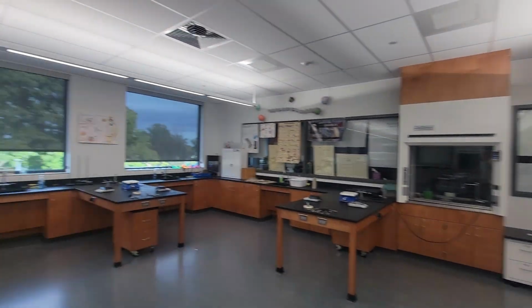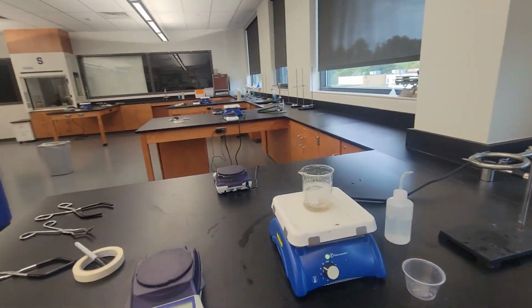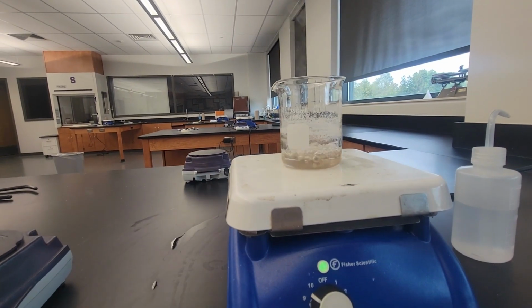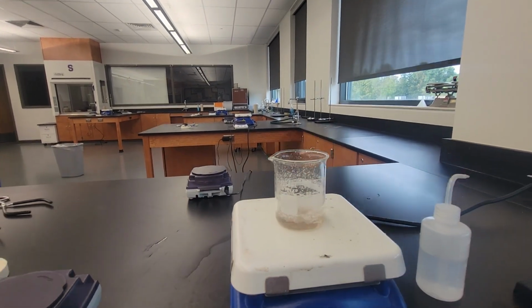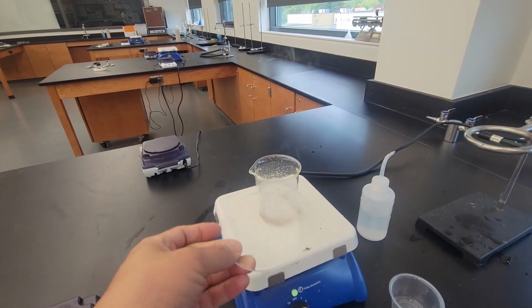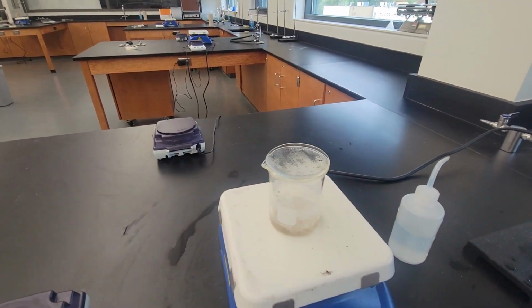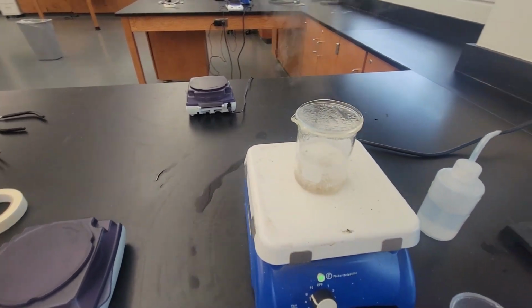Let's see how. So now the water level is low enough where I'm going to start to see spattering. So I'm going to cover it up with a watch glass so I don't lose my salt, which is what I'm trying to get.